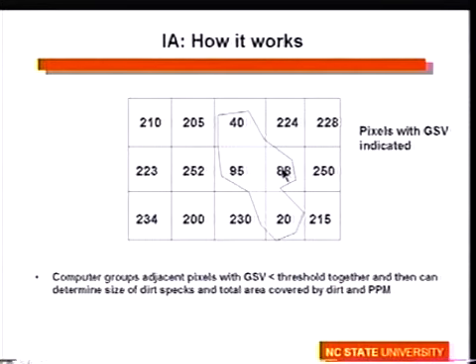And finally, at the end, when it sees that there are no more adjacent dark spots, it will calculate an area of that, or a size of that particle.